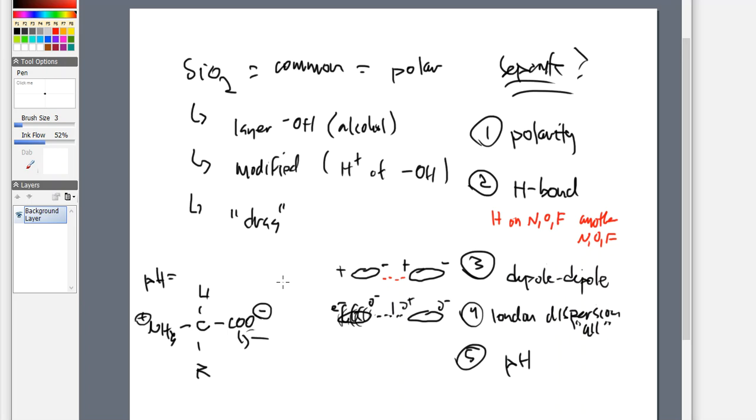And now all of a sudden, we don't have straight up hydrogen bonds, but we actually have a full-blown negative charge due to the deprotonation that has happened at the carboxylic acid. So now we are talking about different interactions, different ways that that molecule is going to be going in for the kill with the silica.